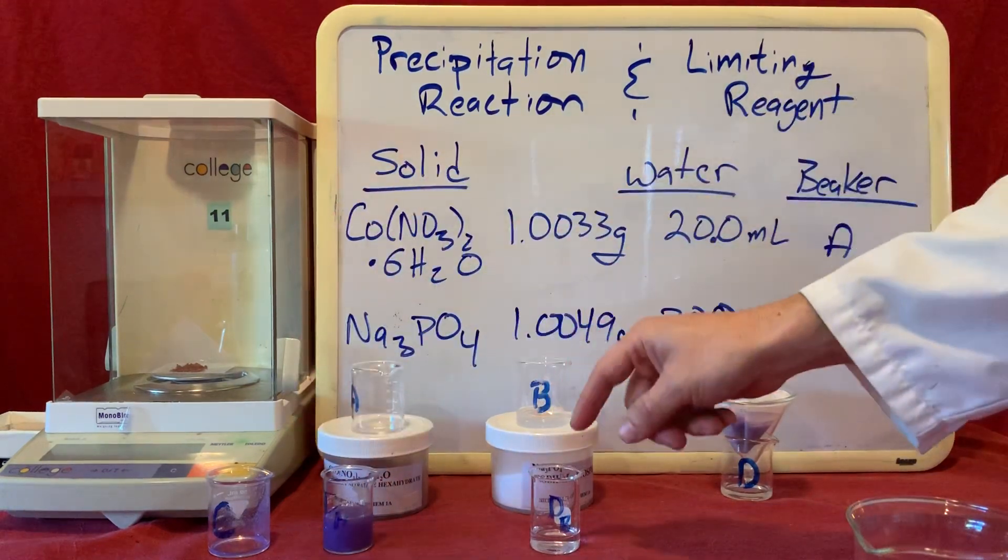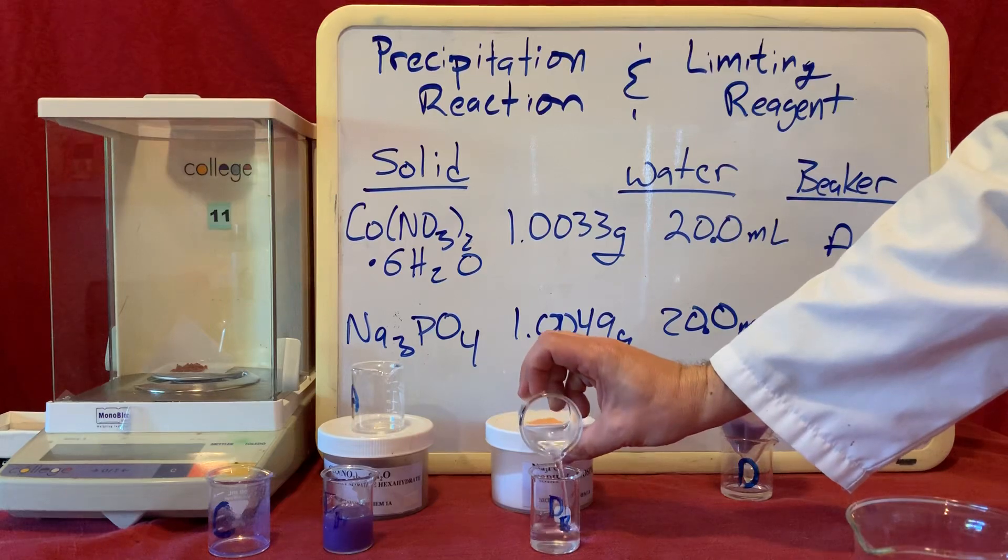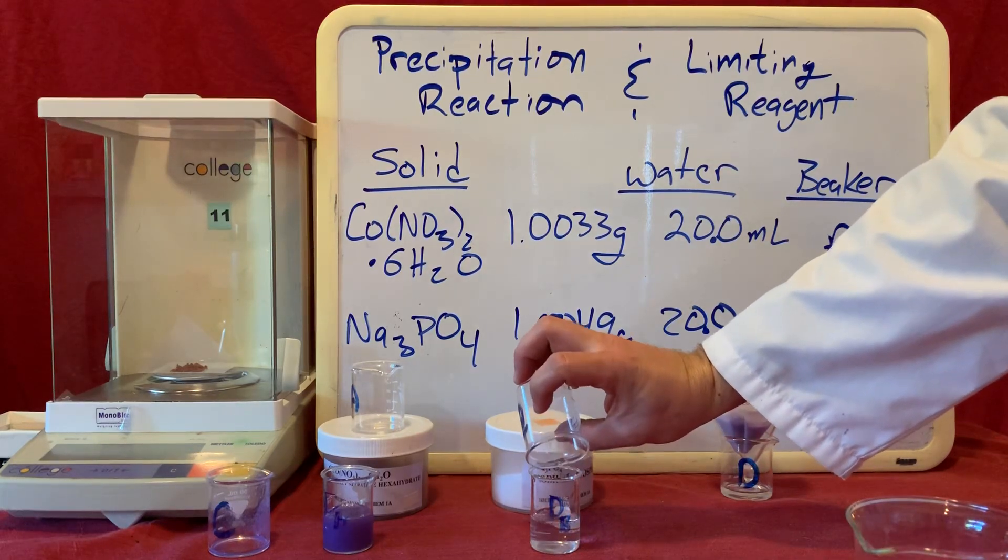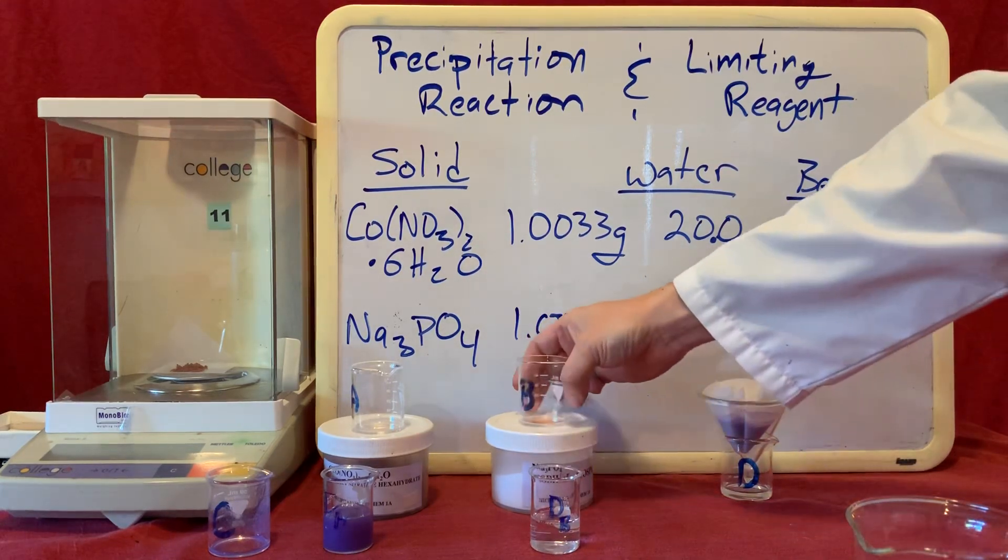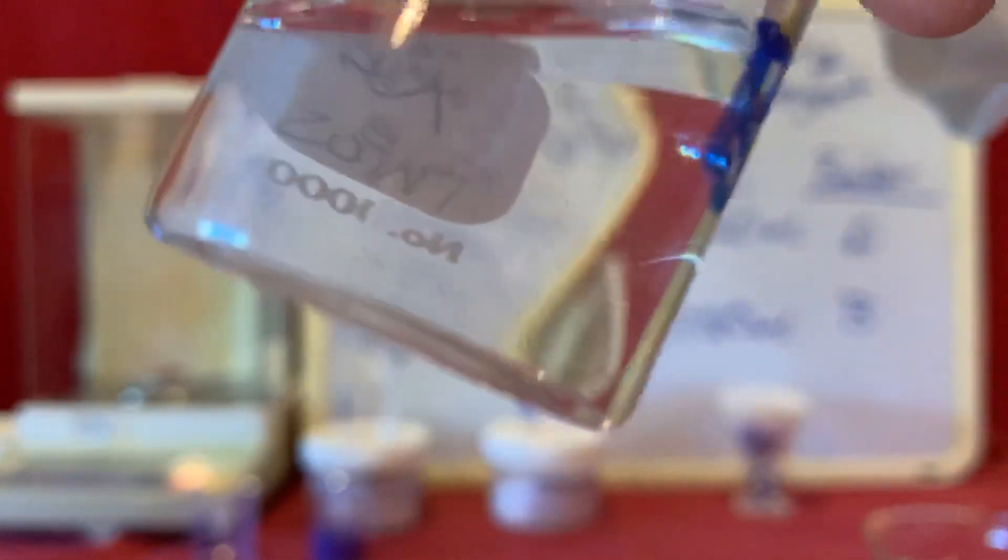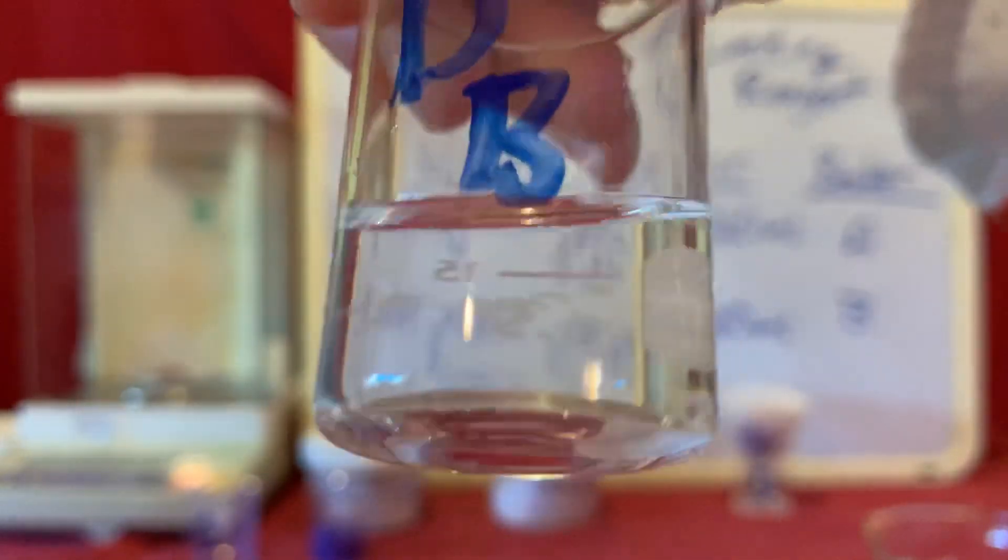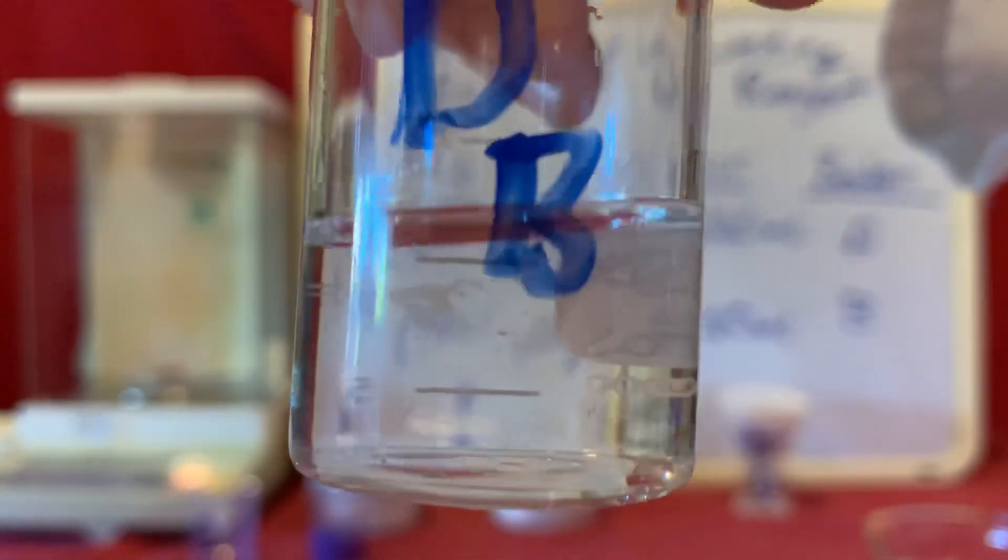Now to D sub B, let's add the remainder of our B solution. And here's what that looks like. D sub B, you can see our solution sitting down here in the bottom.